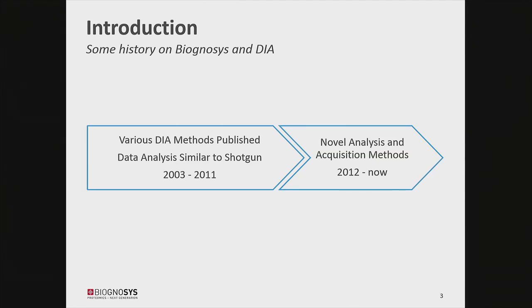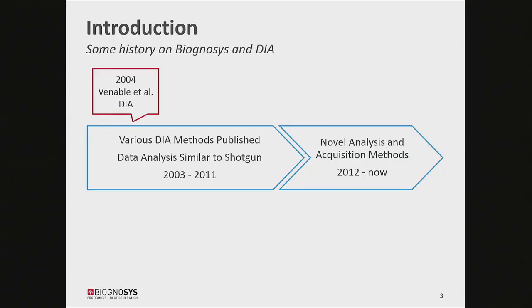As was already said, we used to be working in the lab of Rudi Aebersold before, and at the time when we made the transition, when Biognosys was founded and I started to work for Biognosys, these ideas around DIA and targeted analysis started. But before that, a whole lot of different DIA methods were already published. In 2004, for instance, the term DIA was coined, as far as I know, in a publication of Venable et al. After that, in 2006, there was a first publication about MSE, the DIA flavor of Waters, you could say.